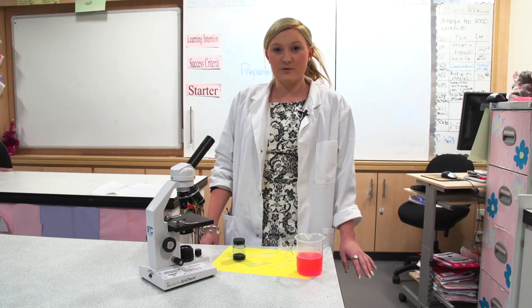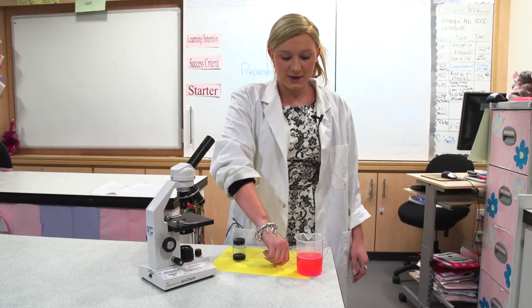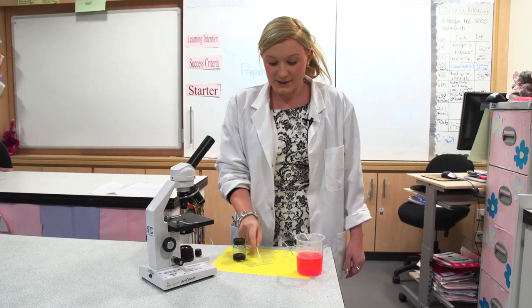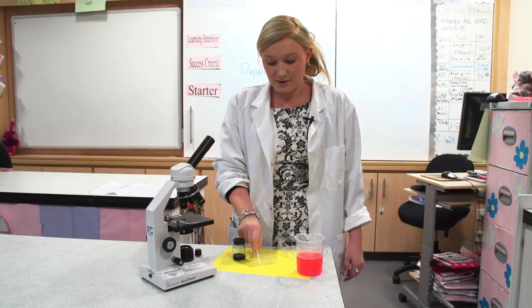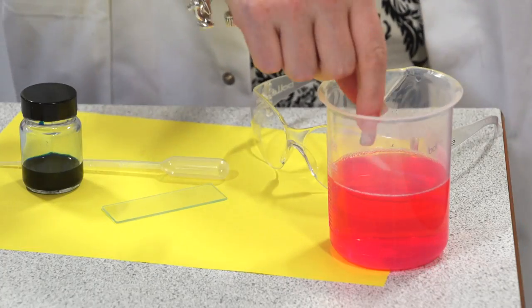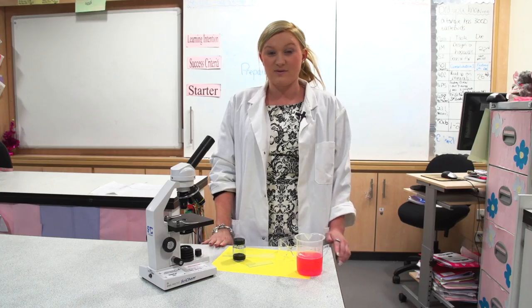To collect a sample of your cheek cells, take your sterile swab and rub the inside of your cheek for approximately 30 seconds. Rub the cotton bud in the centre of your glass microscope slide, then dispose of your swab into the beaker of disinfectant — this will get rid of any germs.